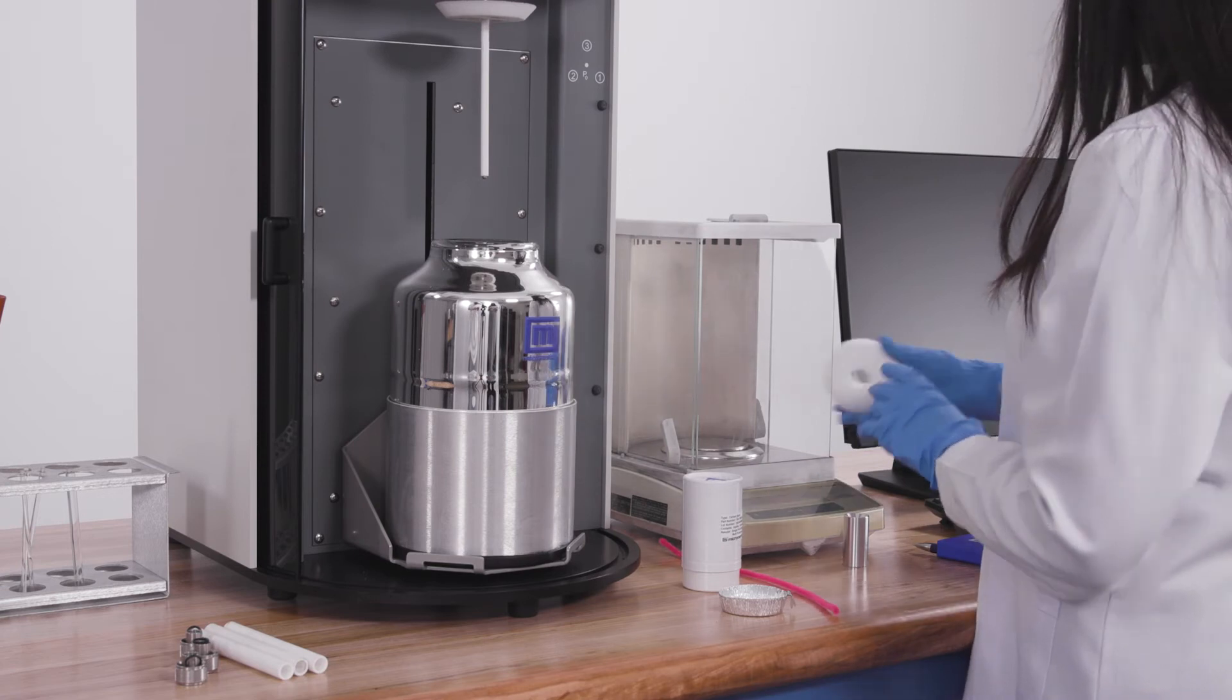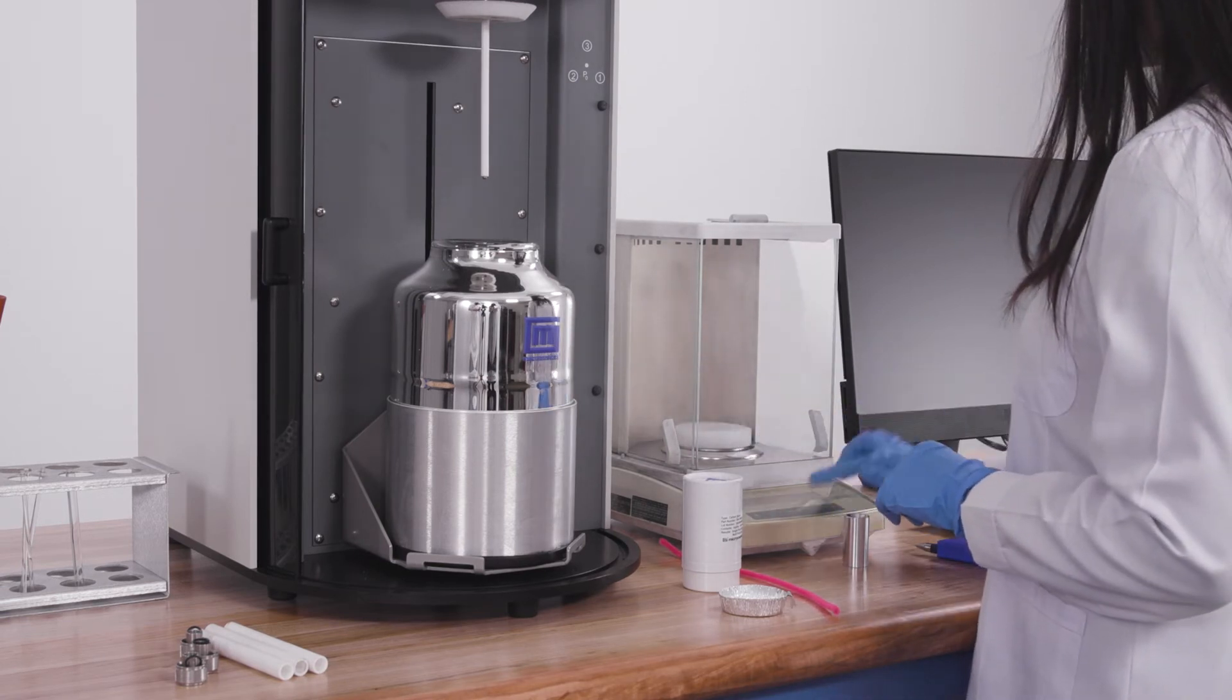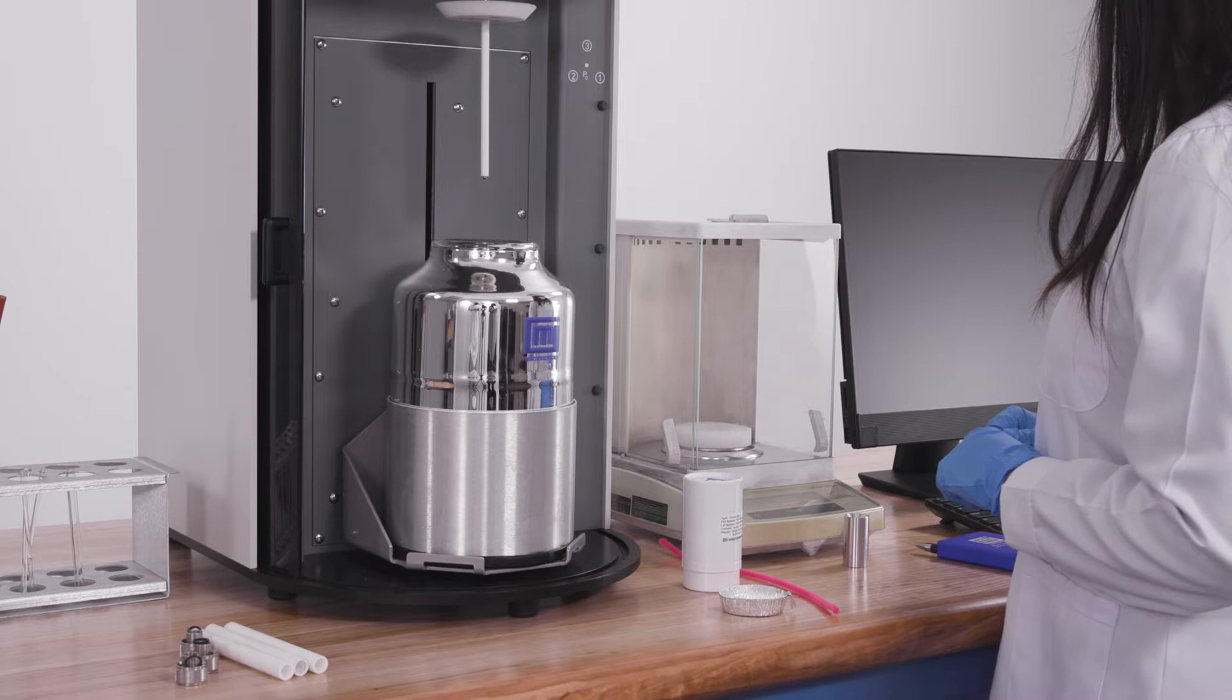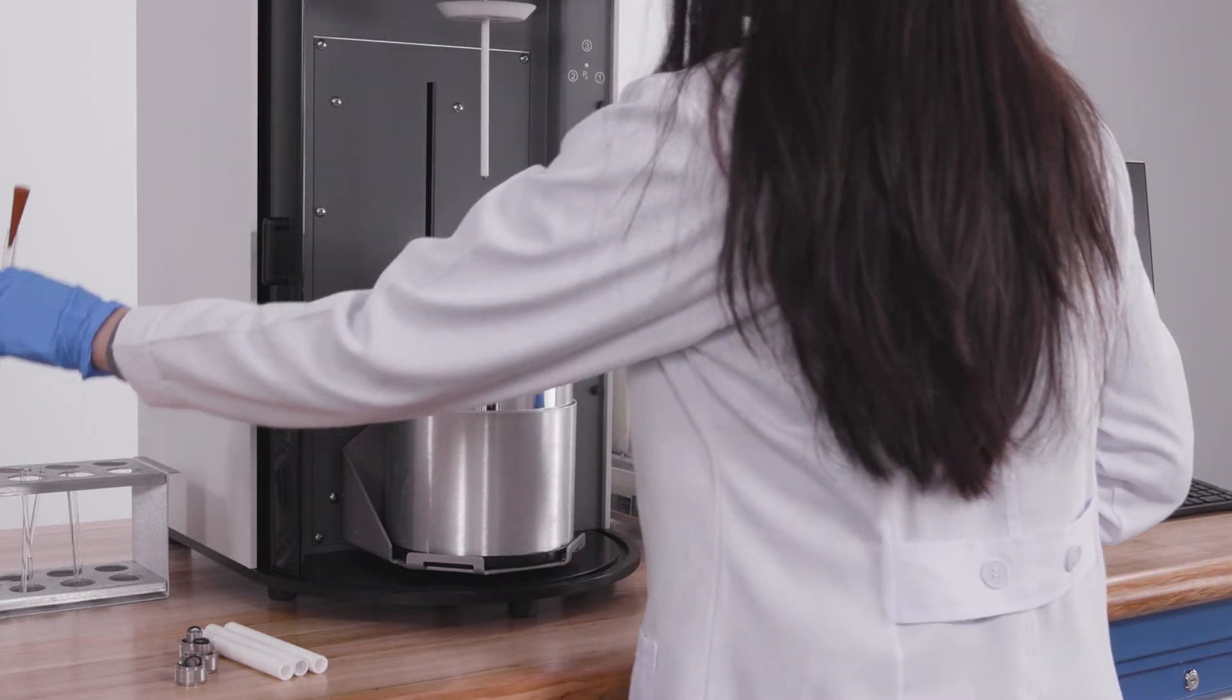To prepare a sample, weigh the empty tube with a rubber stopper using the weighing support. Use your good lab practices to determine the mass and record.